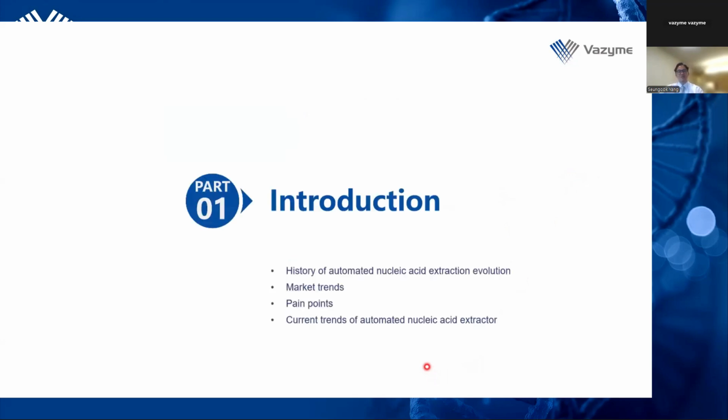Our introduction will begin with a brief history of nucleic acid extractions, then move on to explore some key market trends, and then highlight a few common pain points and challenges that many laboratories continue to face in their daily workflows. And finally, I will talk about what's new in the technology and where the field is heading in the near future.